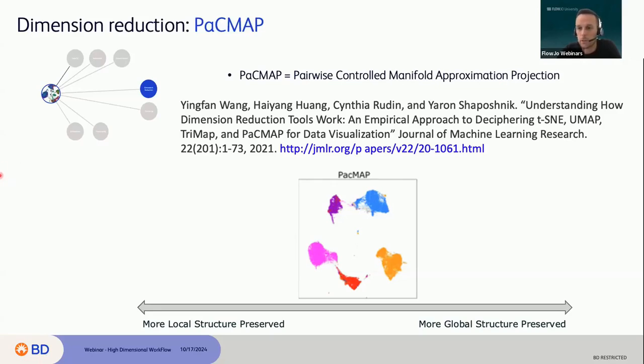You're talking about t-SNE or UMAP in the dimensional reduction. You should select all the markers. Yes, maybe except your live/dead marker, and your lineage markers if you already got those cells out. So every marker that is required to define your populations needs to be selected.